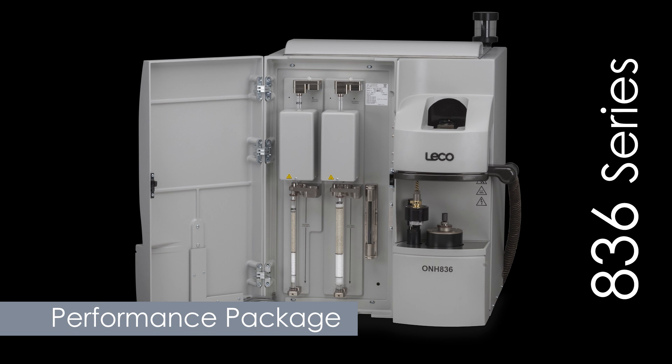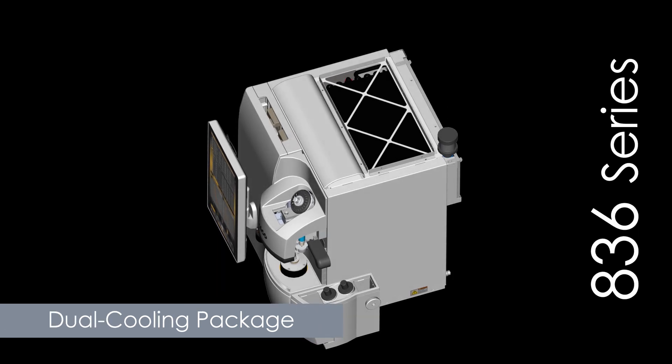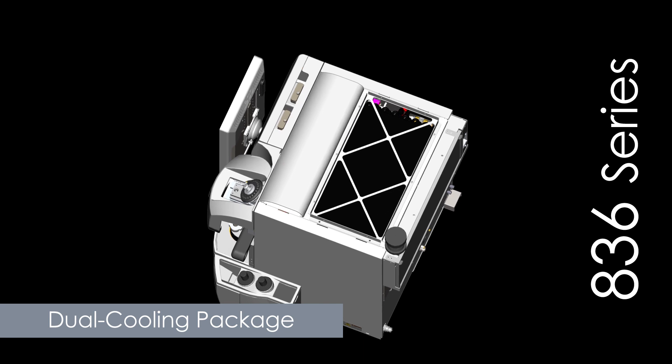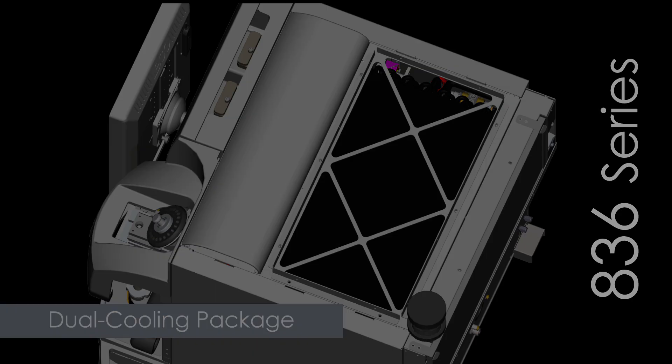Standard features include a performance package, which adds a three-stage carrier gas purification system, gas dose calibration, and advanced furnace programmability. Also standard is a dual cooling package for your choice of liquid-to-liquid cooling, liquid-to-air cooling, or a combination of both, enhancing the system's ability to regulate temperature during the analysis cycle.